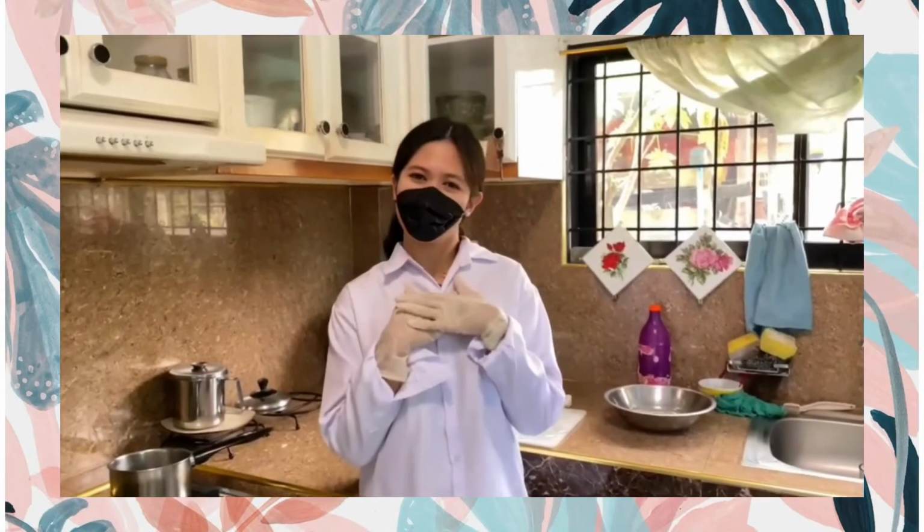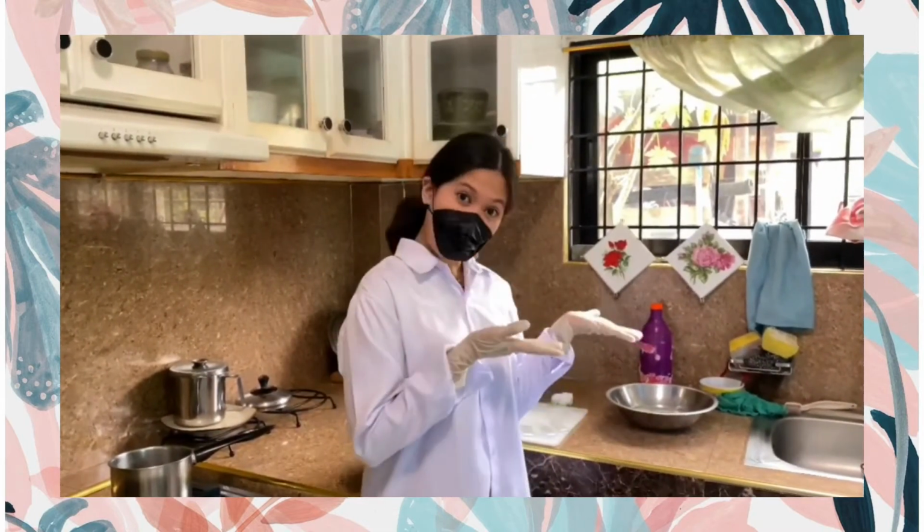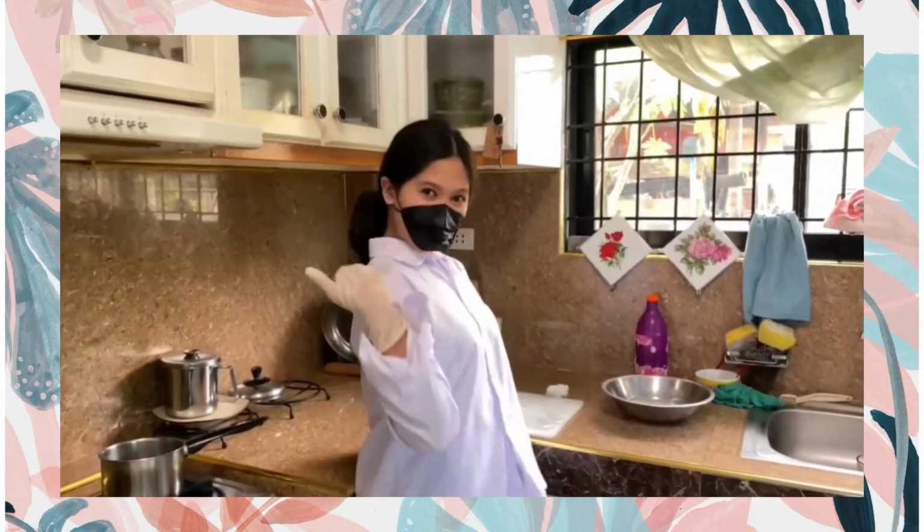Hi everyone, it's me again, Princess, and now I will be showing you how to perform fishing out of the specimen in the histopathology laboratory. Let's go!